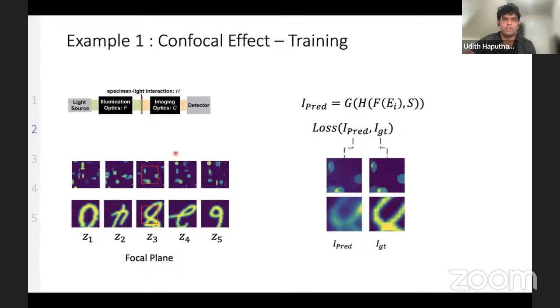So this is how training looks like. Here our goal is to use this model for the real confocal data sets, but also what we want is a general solution for the confocal. In that way, our goal is to train this setup with a synthetic data set, and we want to try it with actual data sets. So these are what our training data sets look like.